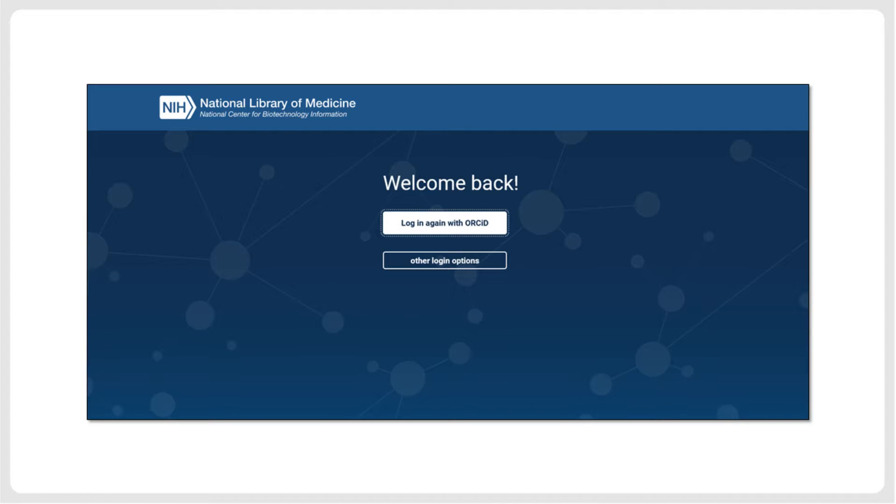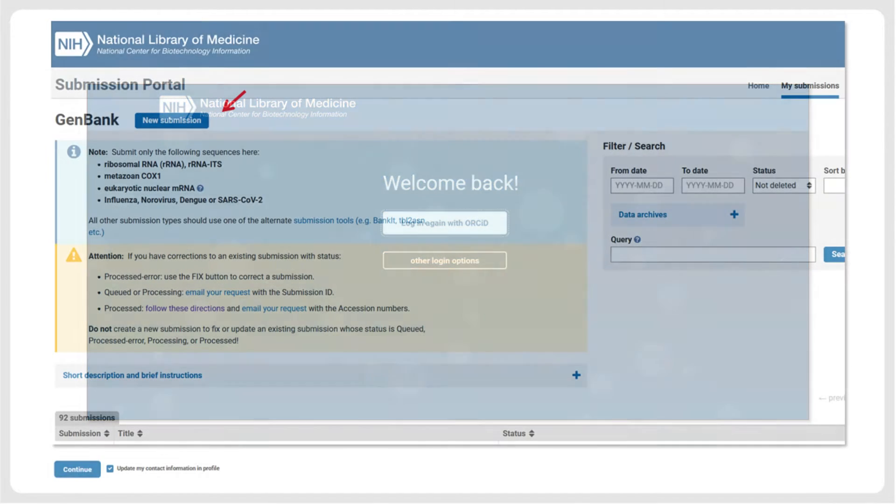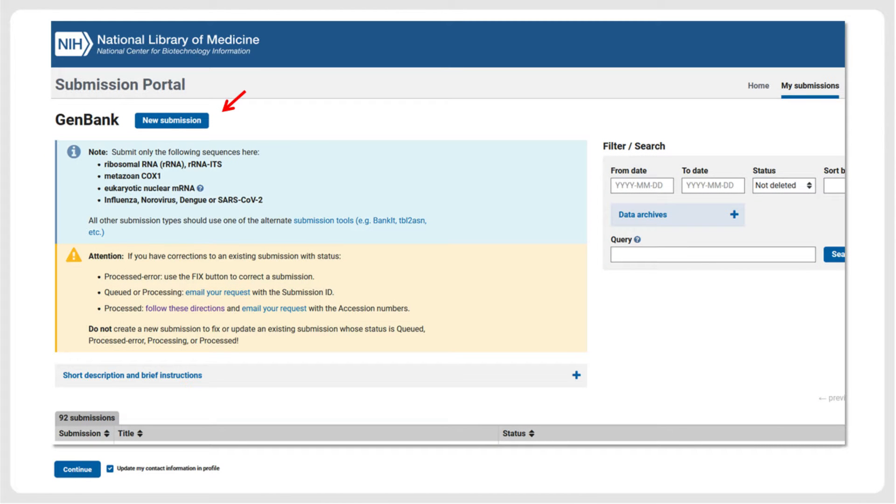To submit sequences to NCBI, you need to create an account in the Submission Portal and log in, which you can do for instance using your ORCID account. After logging in to the NCBI Submission Portal, you can start a new submission by clicking the respective button.